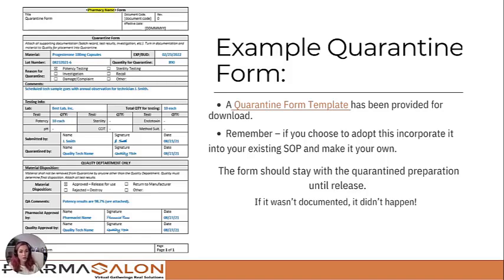Here is an example of a quarantine form. This has been provided to you as a download. It's in a Word format, so you can edit it, so you can make it your own. If you want to adopt this or incorporate it into your existing SOPs, just make sure that you make it your own. Don't just slap your name on it and use it. You want to make sure that it fits your pharmacy and that you have an SOP that goes along with it to explain how it's used and how it's completed.